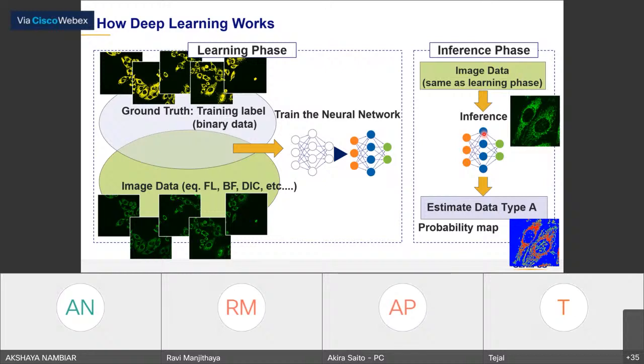The last slide was using a very simple cat and dog image, but for our biological samples, I will use mitochondria images.